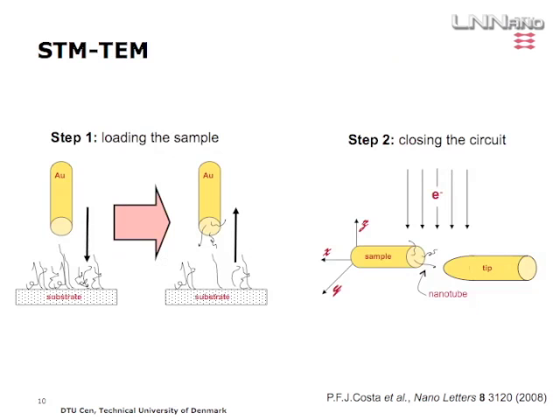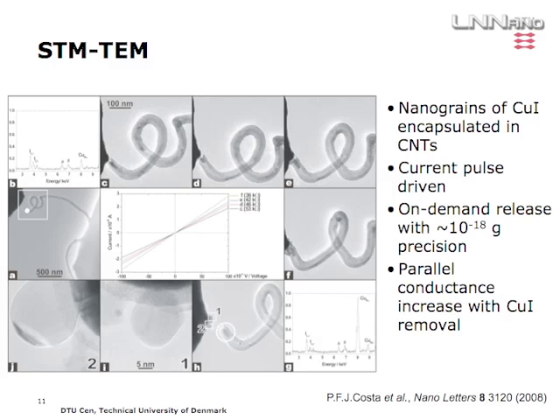What you can do with this kind of holder is take your little needle, put your nanowires on it, then bring the tip and your sample into contact, and then as you see up here, you have your wire sticking out here.